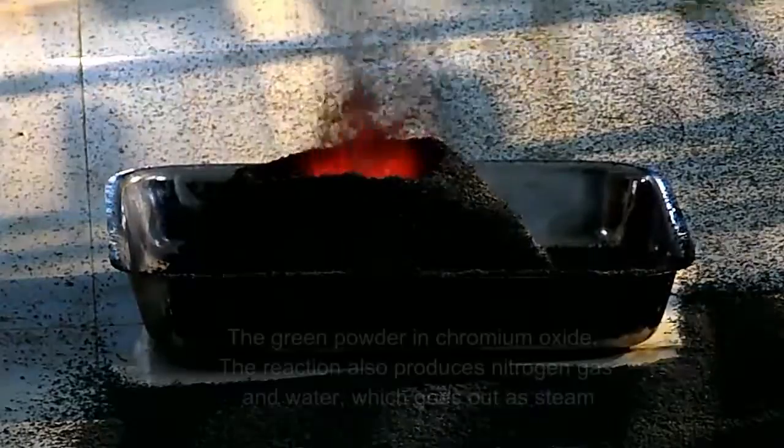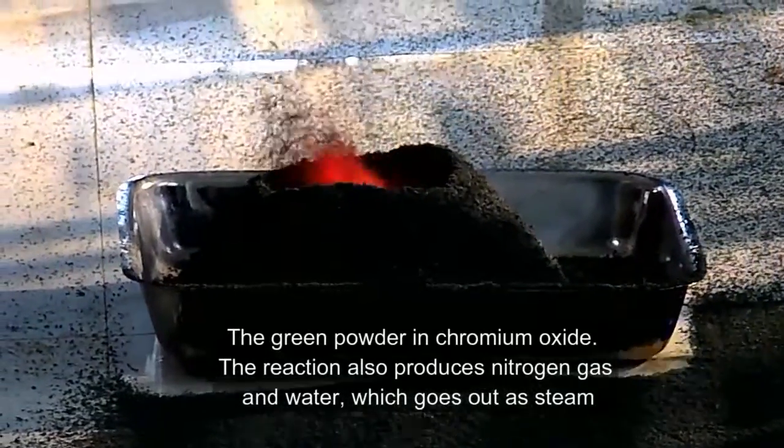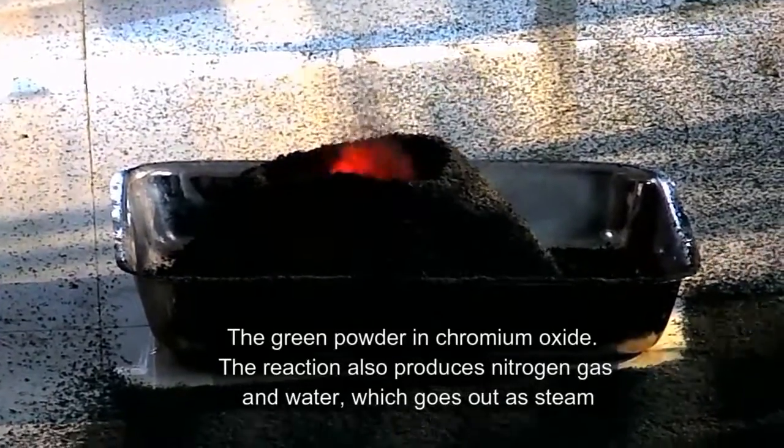The green powder that you are seeing coming out of it is chromium oxide — that's a by-product of this ammonium dichromate volcano. And now the volcano is slowly dying out.